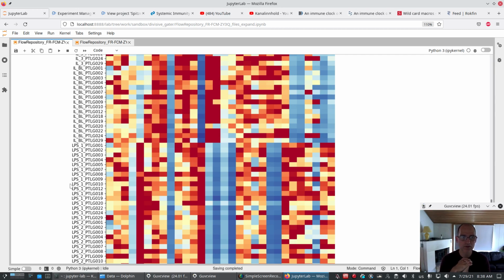I will use a classification tool to say how well these clusters and their sizes discriminate between the different patient groups. So I'll pick out a random sample of the files, and I will see if I'm able to predict from the expressions which group these files come from.